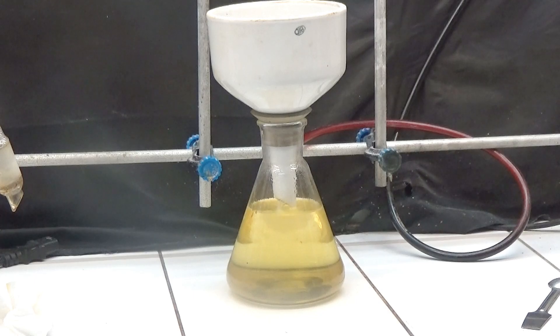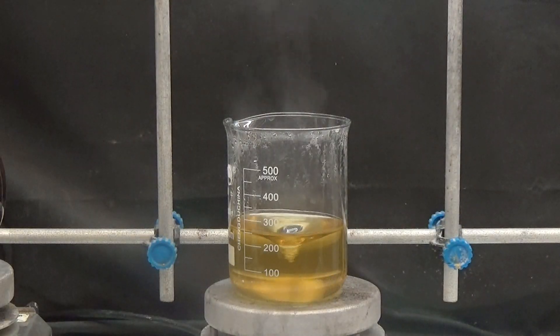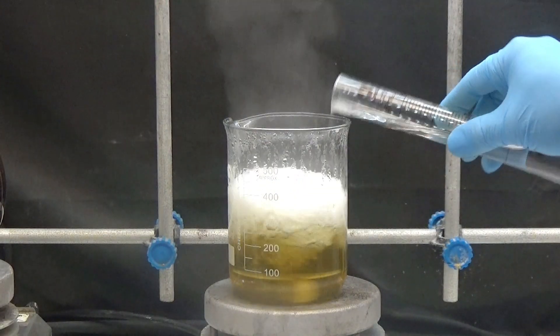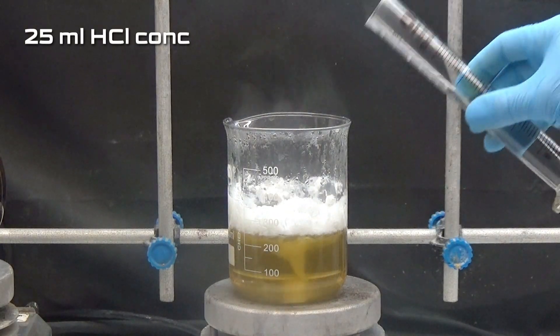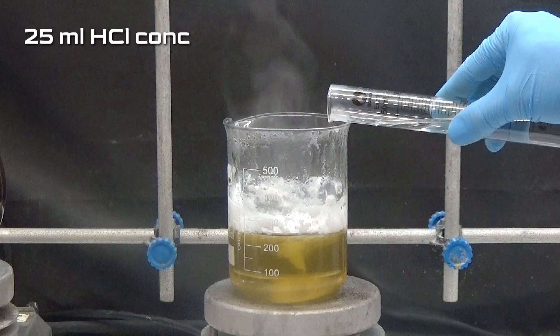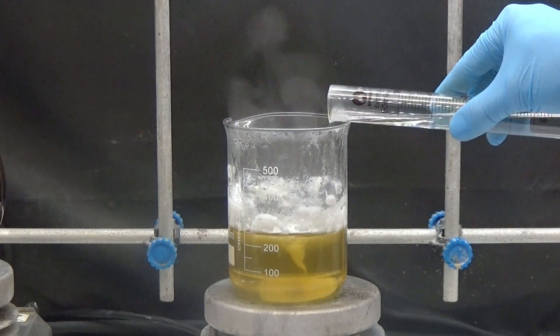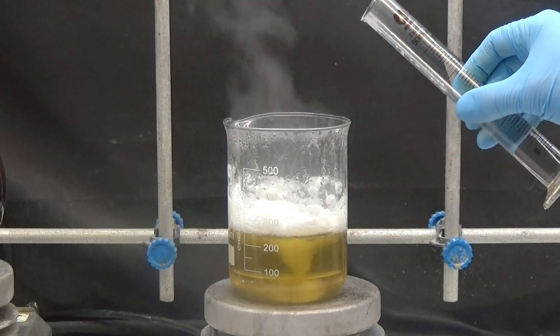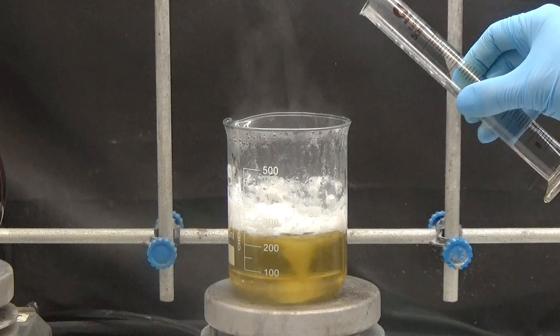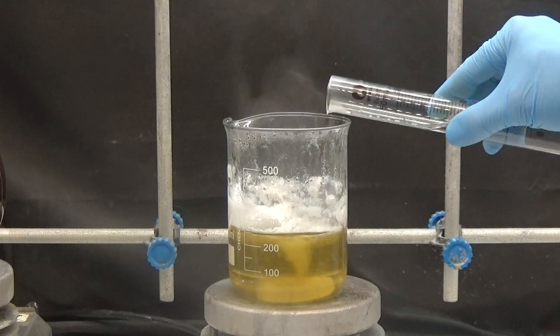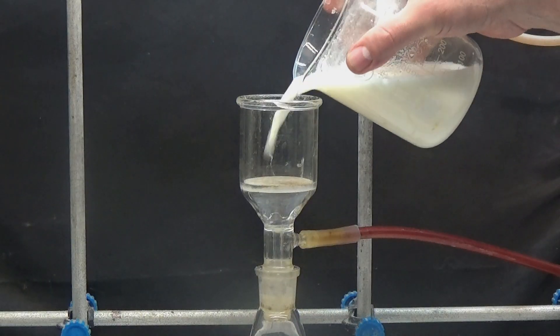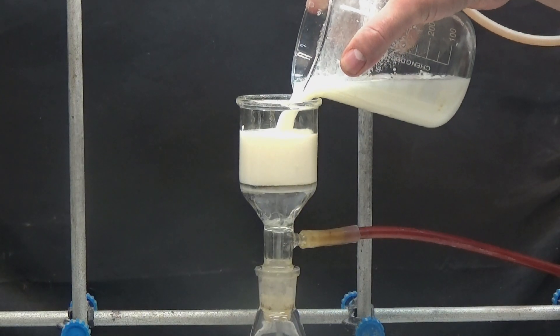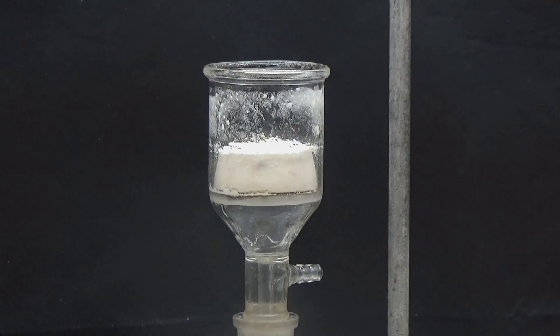Evaporate the filtered liquid to a volume of 250 milliliters. Without cooling, slowly add 25 milliliters of concentrated hydrochloric acid. A white and voluminous precipitate of orthochlorobenzoic acid is appreciated. Allow to stand for about two hours and collect the acid by suction. Wash the acid twice with 50 milliliters of cold water.